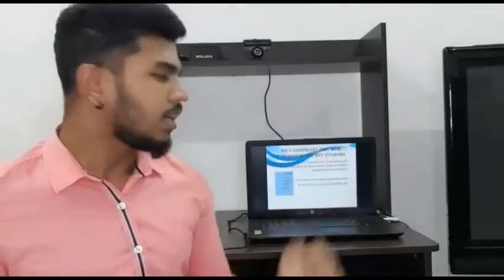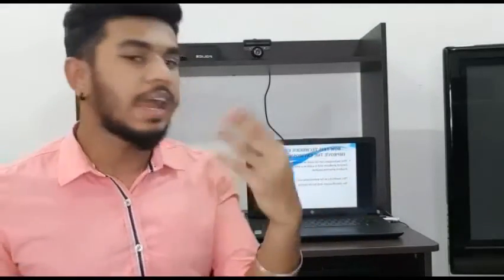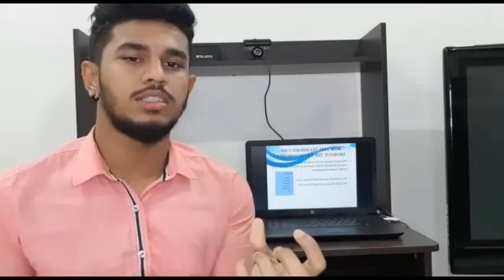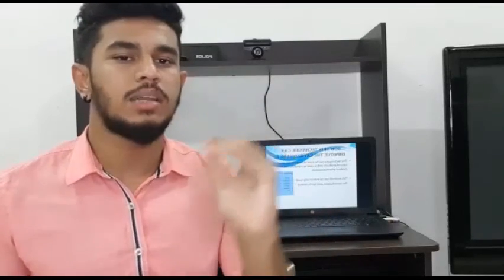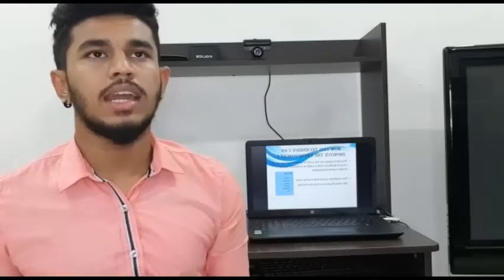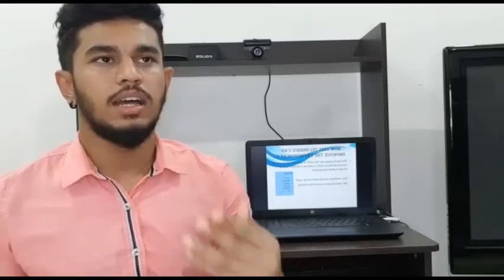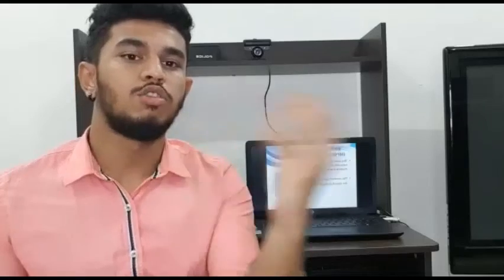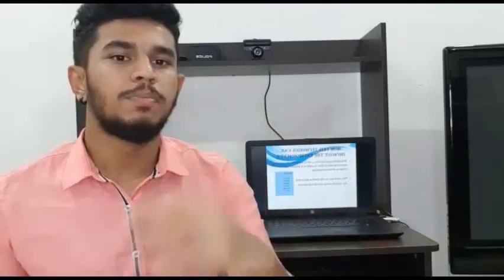As my second point, this technique can be extensively used as a purity testing tool. We can test how pure this product is, how original it is, what is in that product. For the environment, this can be very beneficial because it can tell consumers or producers that there is this substance in the product, and then they can look at it and say, okay, this is not good for the environment, so we have to change it. They can test what is in their product, and they can make changes to better the environment.